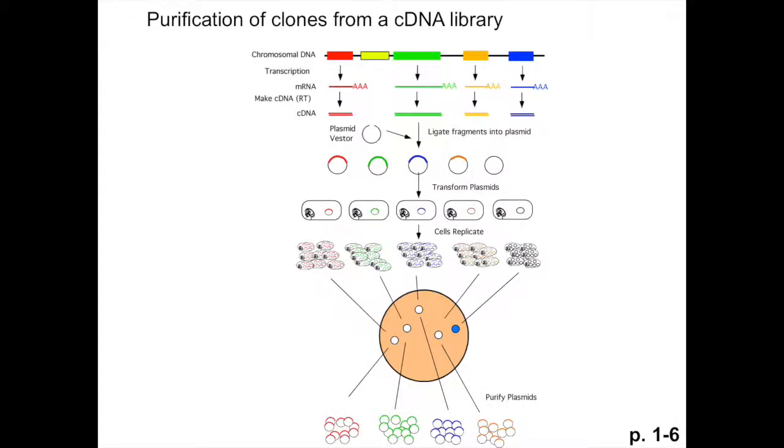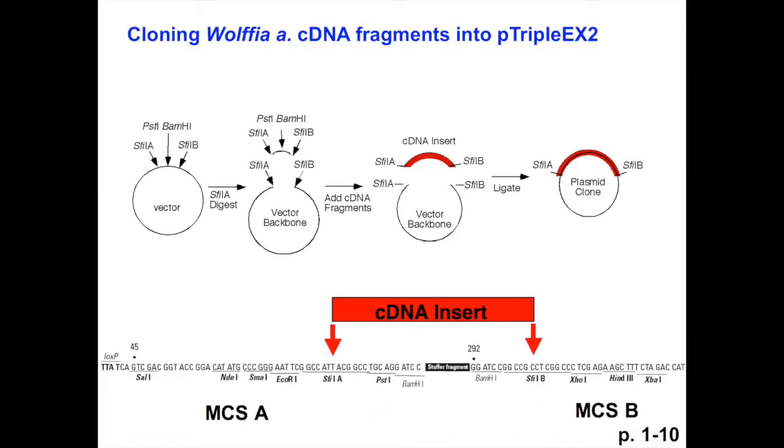And we're going to take a look at how restriction digests work and how we use them in this course. This slide should be pretty familiar to you by now. At this point, we've done all these steps, but now we need to verify the size of our restriction digest and actually take a look at our MiniPrep to see if we were successful. So let's move on, and we're going to take a look at where the DNA was inserted.